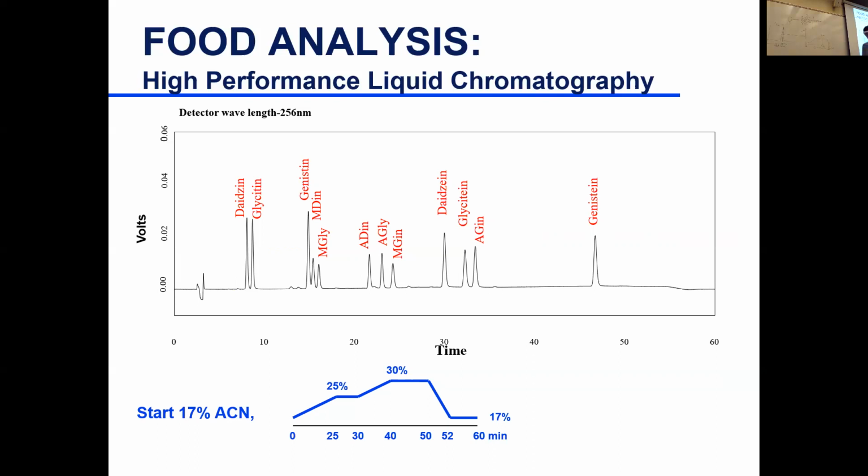So two things will happen. First, the whole analysis time will be longer. Second, it won't be efficient at all. You don't get good separation. Okay.